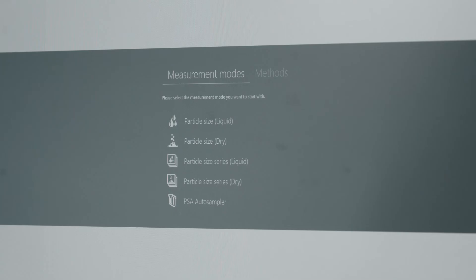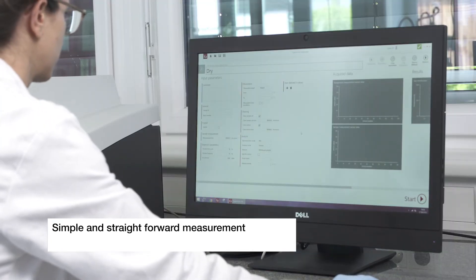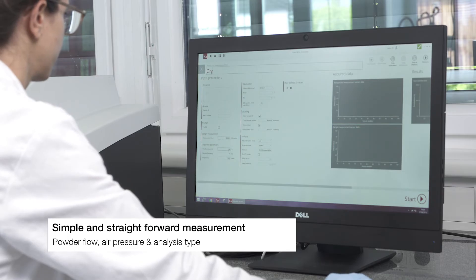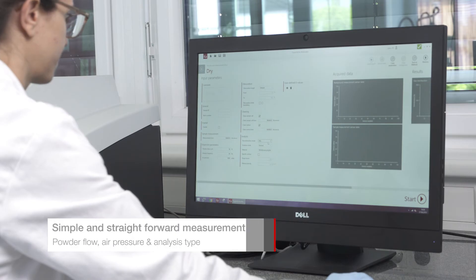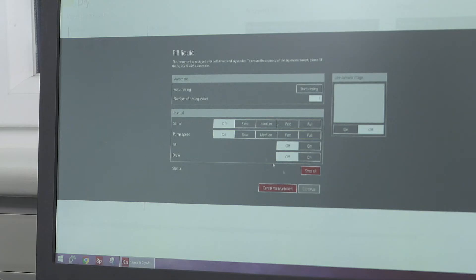Again, the measurement is set by choosing the basic parameters in the Calliope software. Those parameters include dispersion settings like powder flow and air pressure, analysis choice, and others. All of those settings and more are on the same screen, allowing for an easy setup.